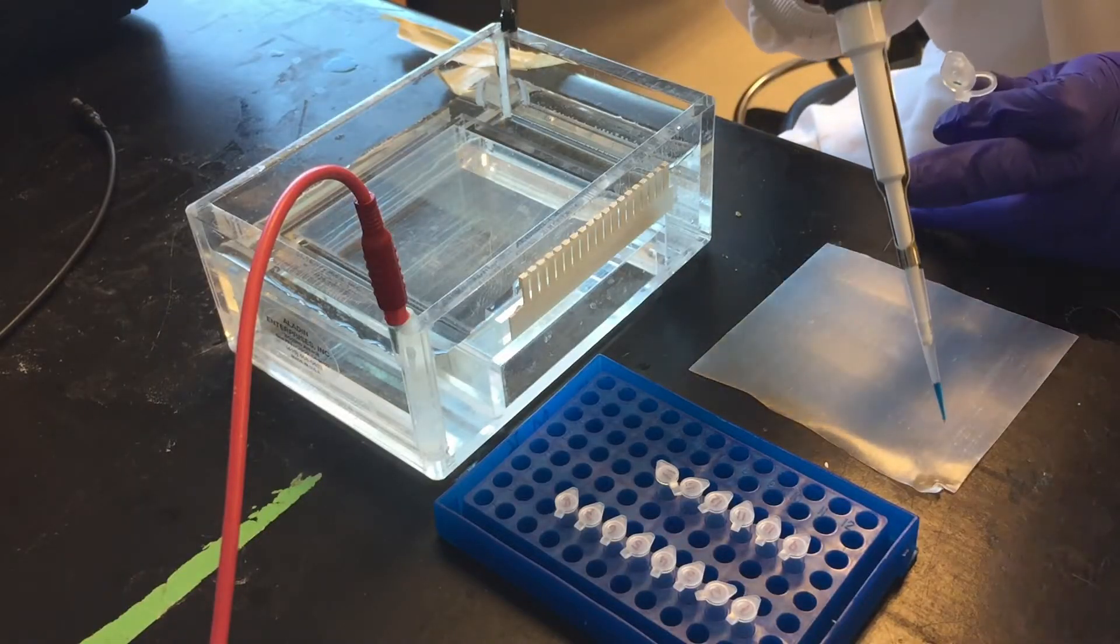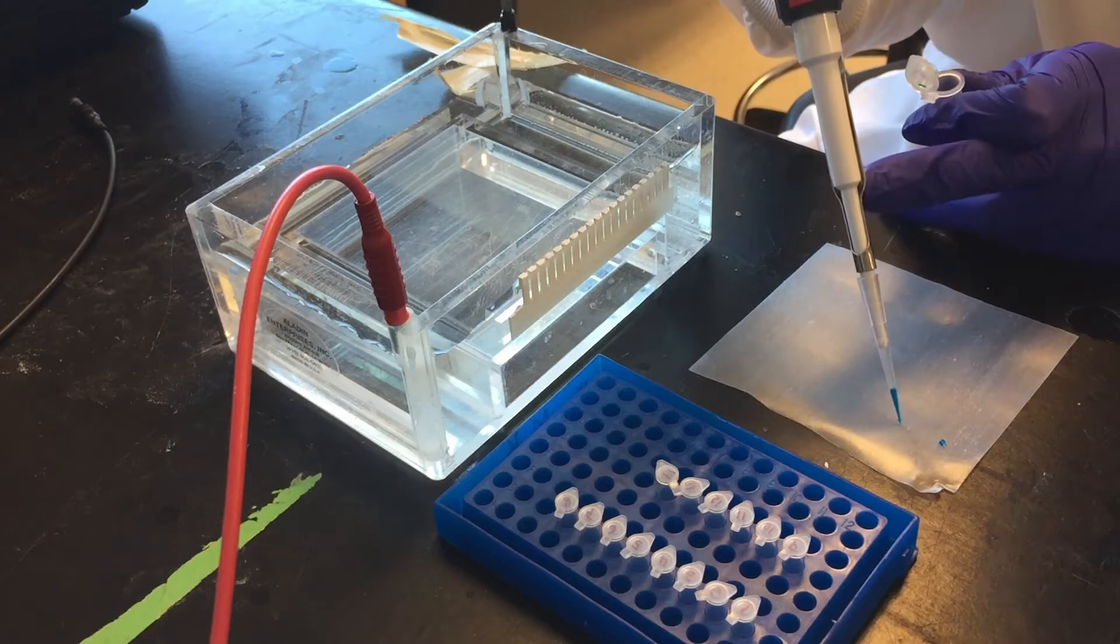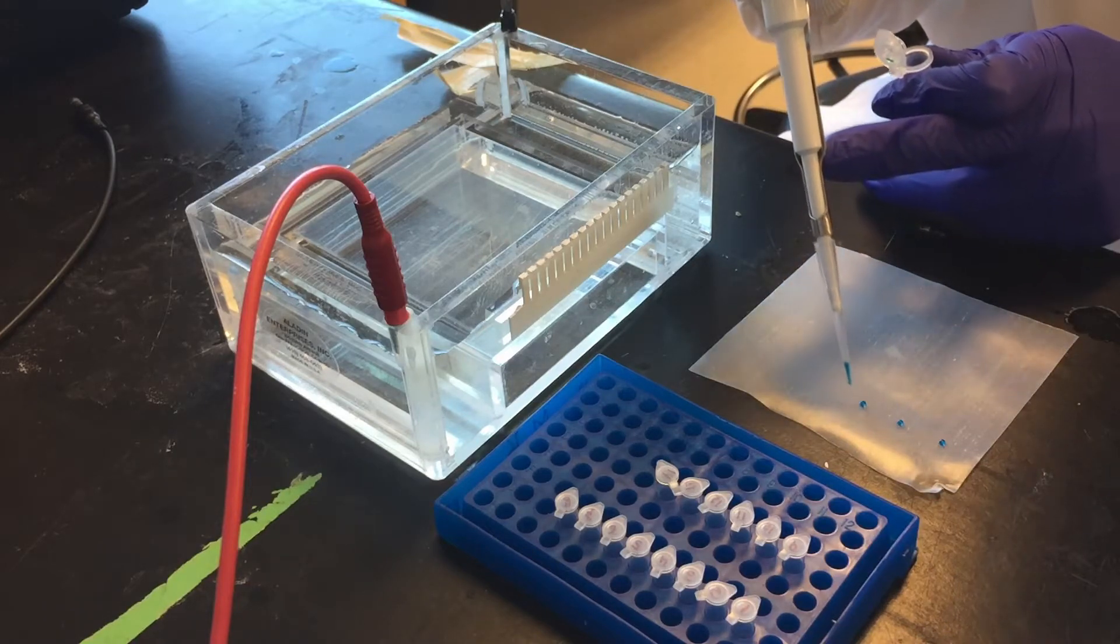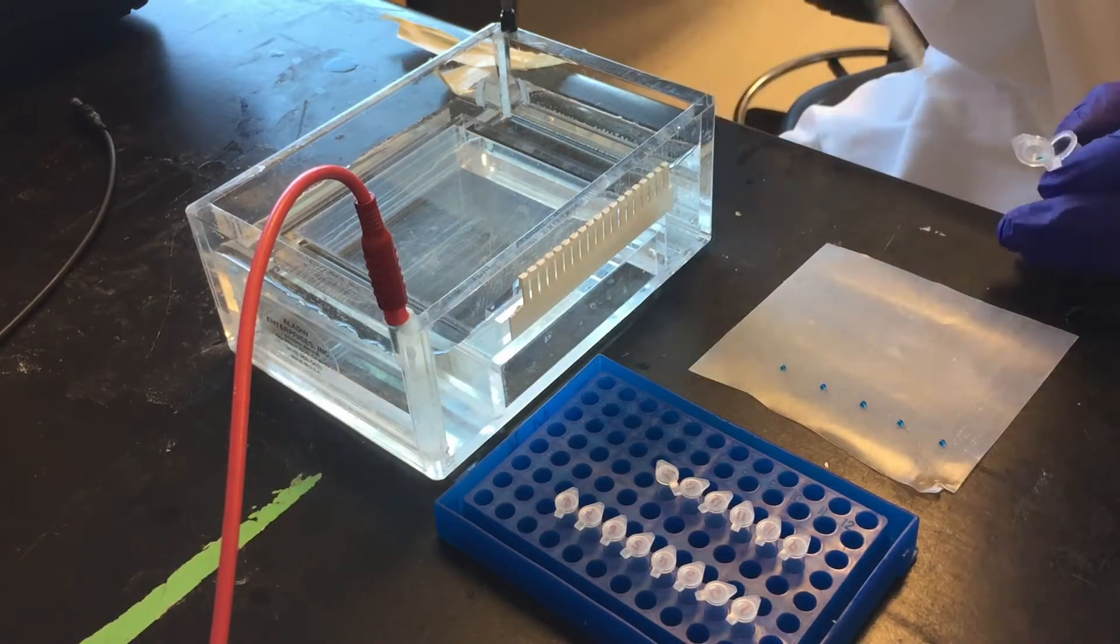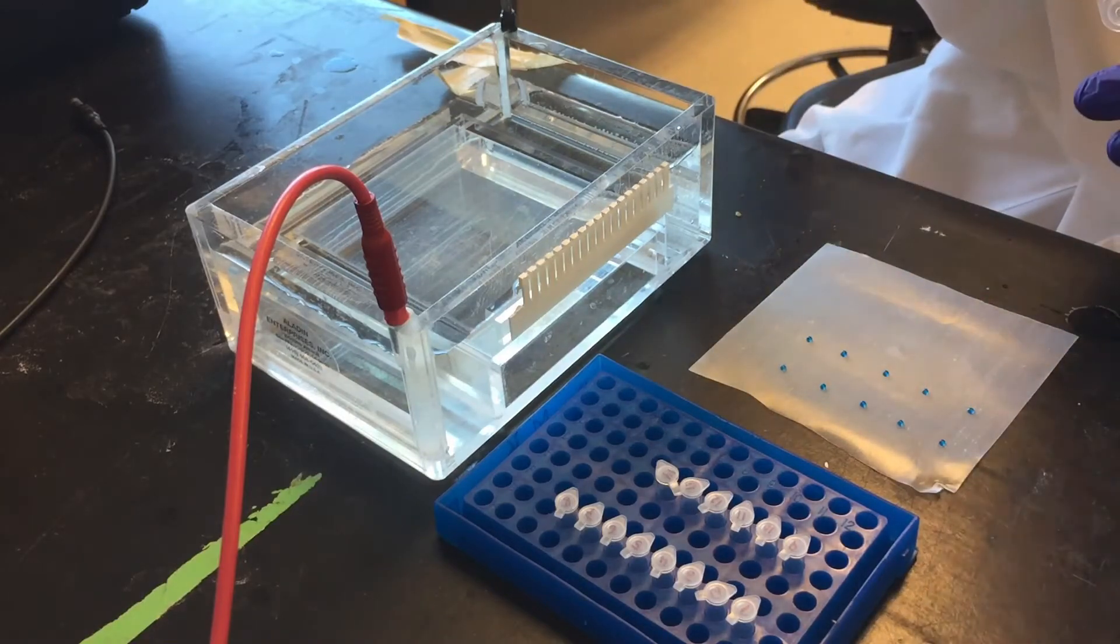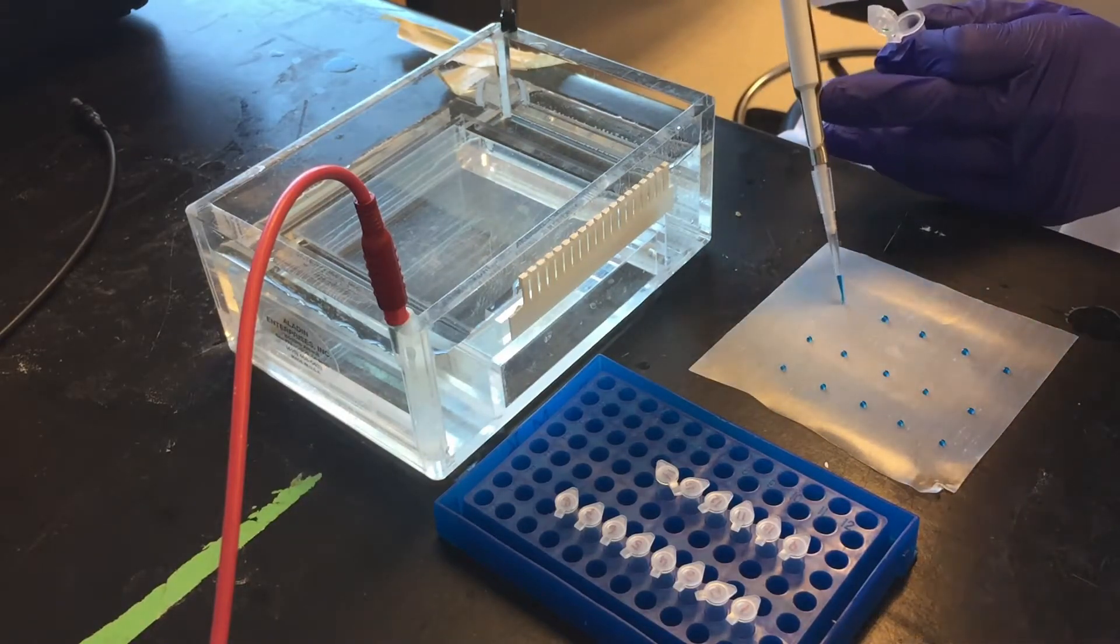And I like to use this method where we put loading dye in little drops on parafilm so we can basically just mix and load the samples immediately using the second stage of the pipette.